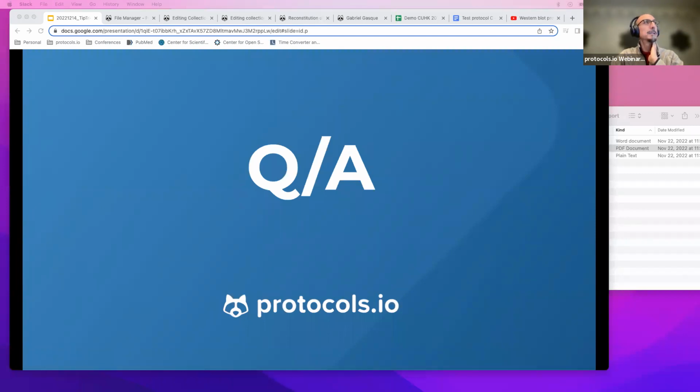Any other questions while I verify whether the smart component can do calculations? And I've been confirmed the smart component cannot do calculations. So it is for you to enter values, but it cannot do calculations.